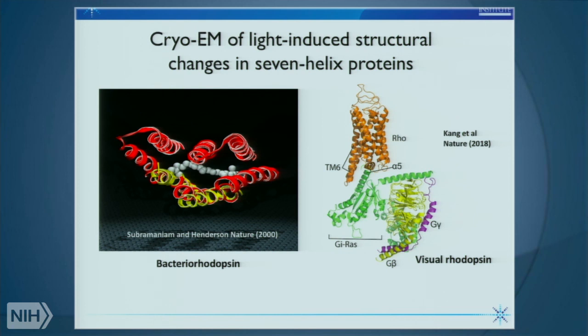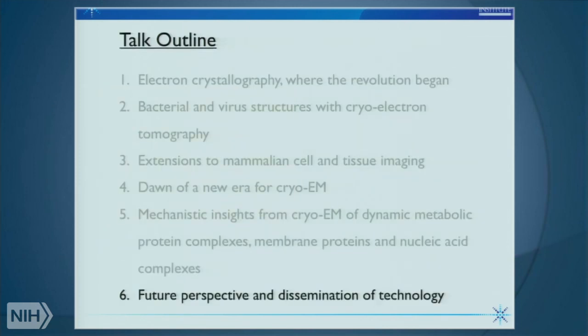But the interesting mechanistic insight is that the helices that are involved in these changes are remarkably similar. Helix 6 plays an important role, as do some of the other helices. But it's certainly been an important advance to no longer need to depend on 2D crystals to get at these kinds of structures.